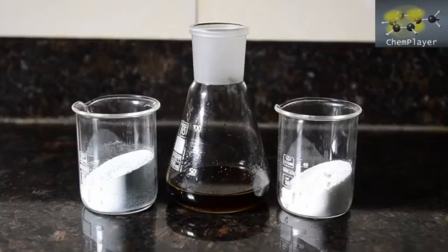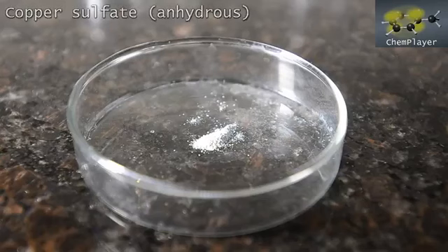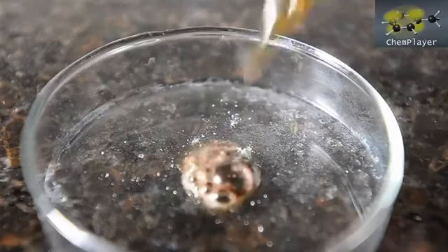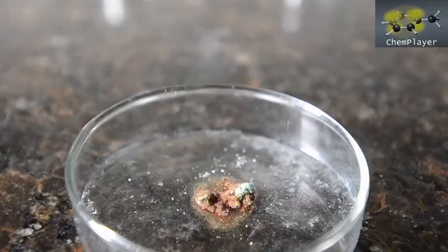Let's just test on a tiny scale what happens when the cyanide solution meets the copper sulfate powder directly. A dark color, and cyanogen gas. This is not what we want to happen. So we'll watch closely when we do the reaction.